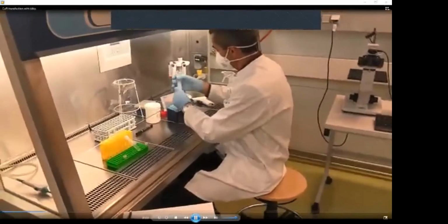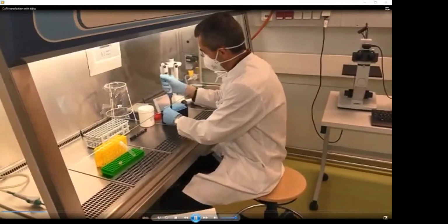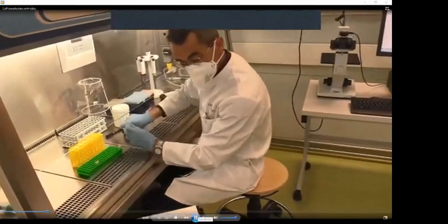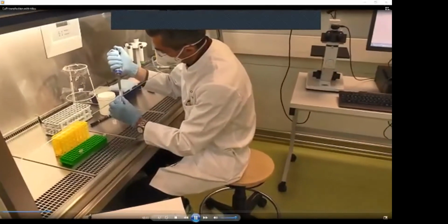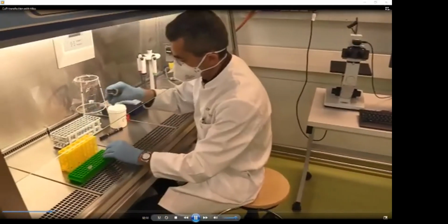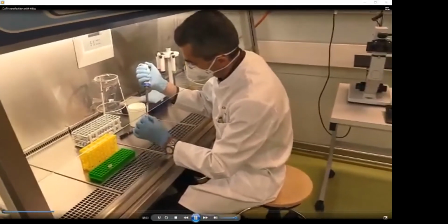So don't forget to do it always. Always clean the pipette with ethanol. Then we take this sterile tip and the HBS, the correct volume, which is this 520 microliters, and pipette that carefully. That means that it has to be this 520 into the tube number A.